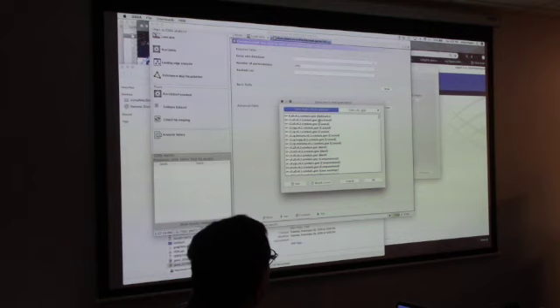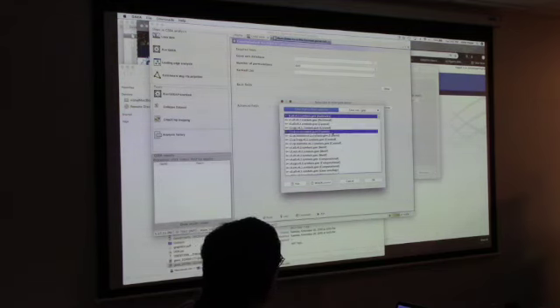So I'm going to select the hallmark or, let's say, which one is, anybody have a favorite? Should I just go with hallmark? You have a lot of gene sets, so you've got to pick the ones that you like. Let's just say hallmark and, you know, gene symbol.